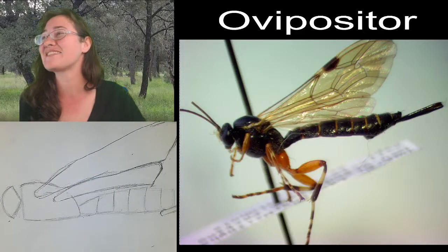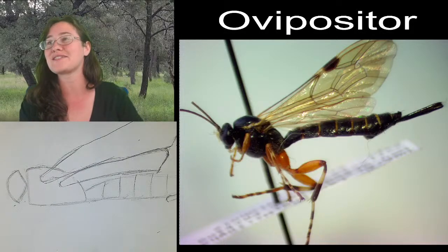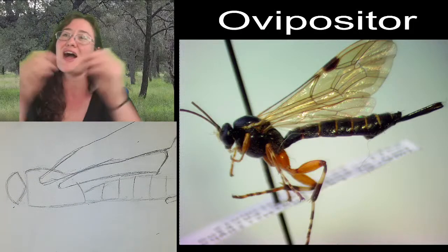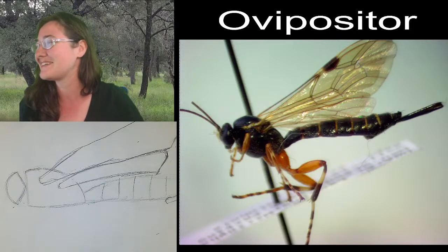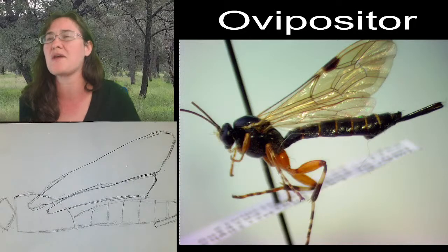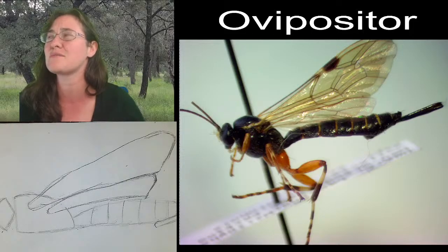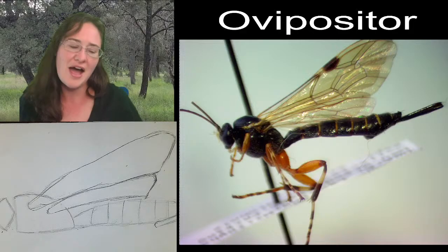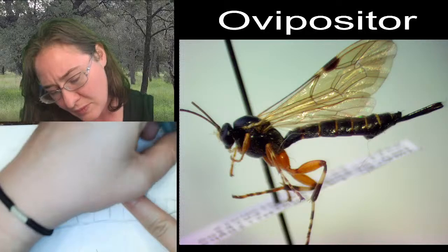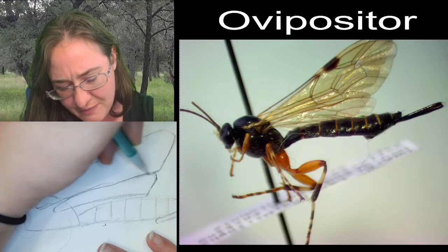This bug did not skip leg day. Oh, that's so funny. Yeah, the femur and the coxa are both fairly globular, I guess we could say. You're right. I think that many wasps, bees, wasps, and ants, admittedly, all have very similar wing shapes, with this kind of triangular tip. I'm not sure if there's a reason for that.